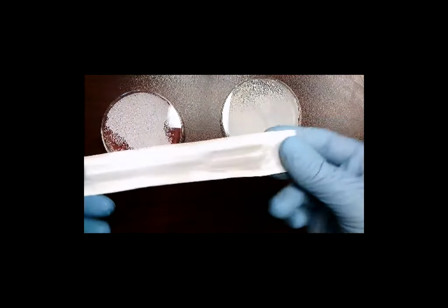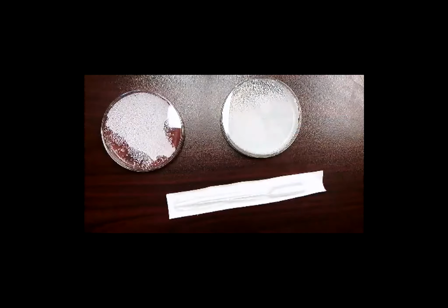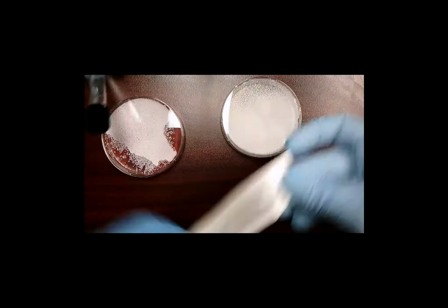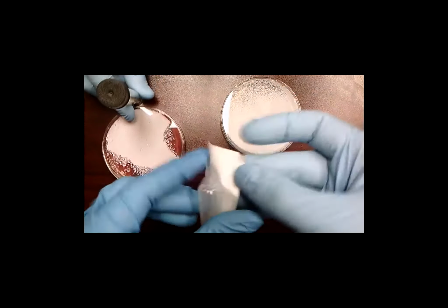So the first thing you are going to do is you're going to have your sample near, and I do not have a test tube holder here. So Matt's going to put his glove on and hold that. So once you have your test tube, you are going to undo the package.